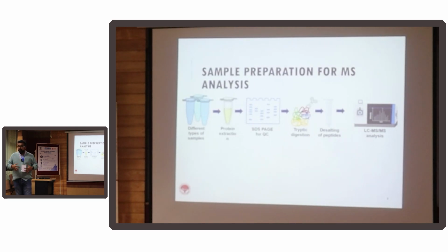This is the main body of the shell of the shirt, right? This is the collar. If you remove those marks, even the best tailors cannot stitch it back. So when your protein degrades, you are not keeping any mark on the protein.